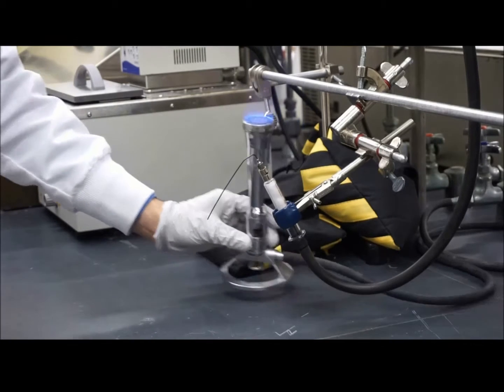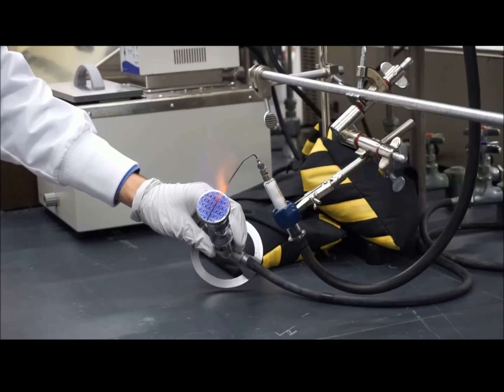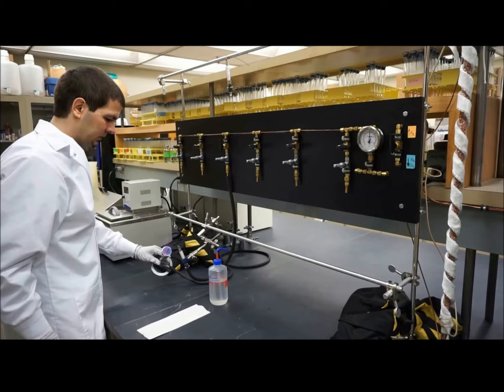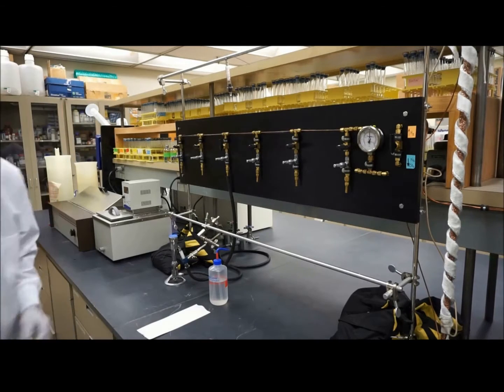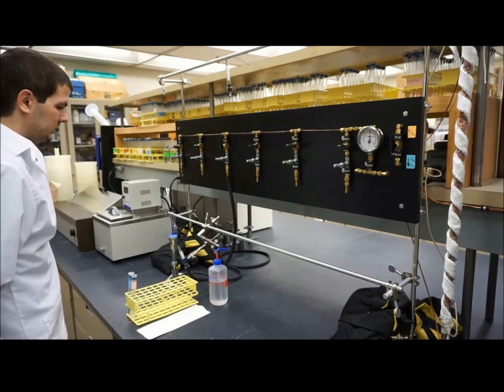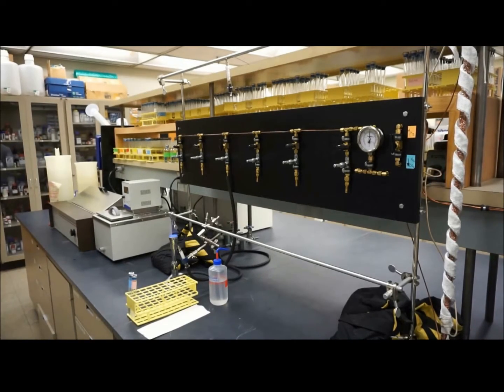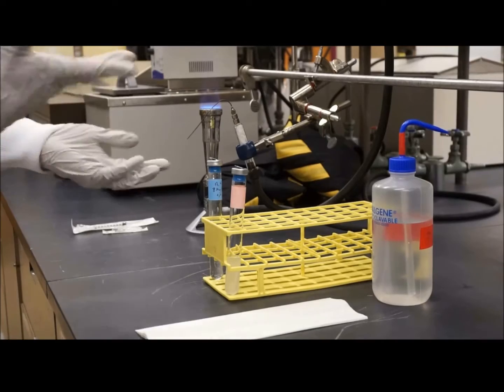We flame the needle of the probe with a Bunsen burner. It should still be sterile from autoclaving, but we flame it as a precautionary measure because it's easily contaminated. We retrieve 2 tubes, one containing the old culture and one containing fresh media. We retrieve a 1 milliliter syringe and needle, which we will use later to transfer the culture.